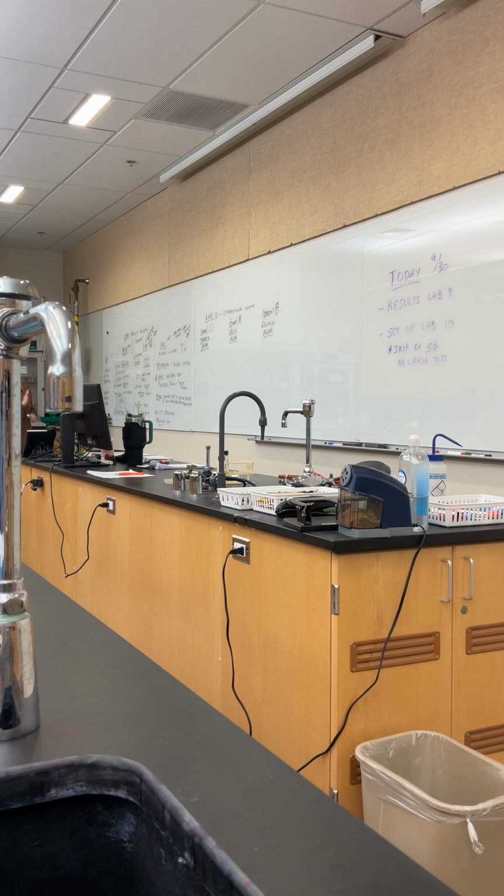All right? So based on these results, which of my organisms are gram-positives? The staph. Staphylococcus. Yep, so Staphylococcus are going to be my gram-positive. Who are my gram-negatives?